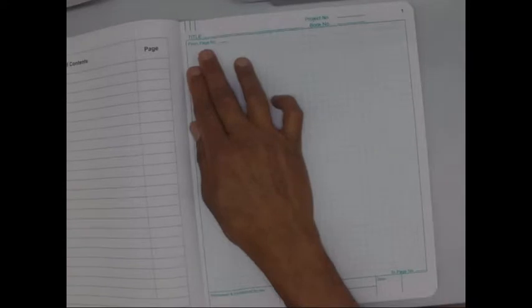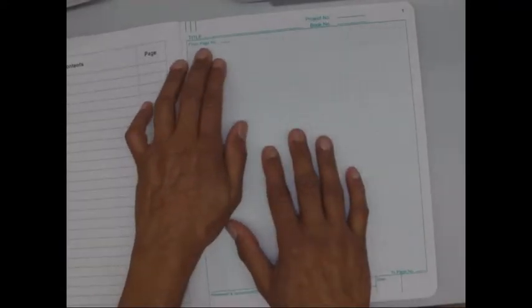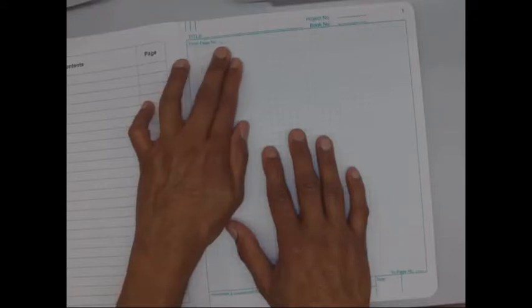On the first page, it says from page number. Here in this particular page, there is no other page before this. Therefore, this can be left blank. But there is also a to page number where it will continue. That means if you're going to continue on page 2, you will write 2 here. Just in case you do not want to use page 2, because something else happened to the page or you wrote something else on the page and you want to continue on page 3, then you will write page 3 here.